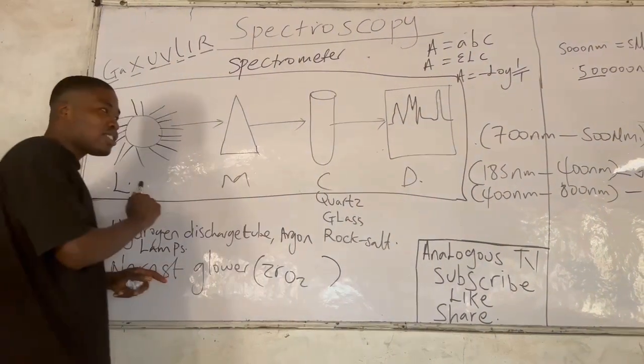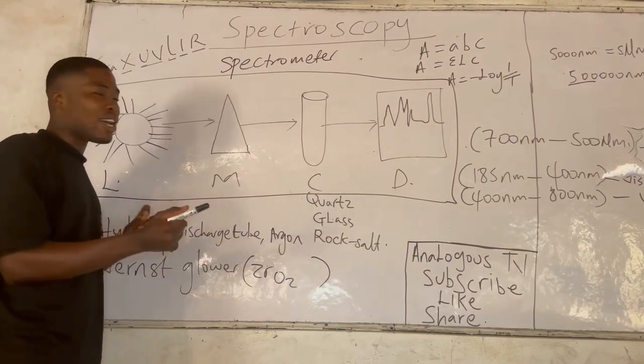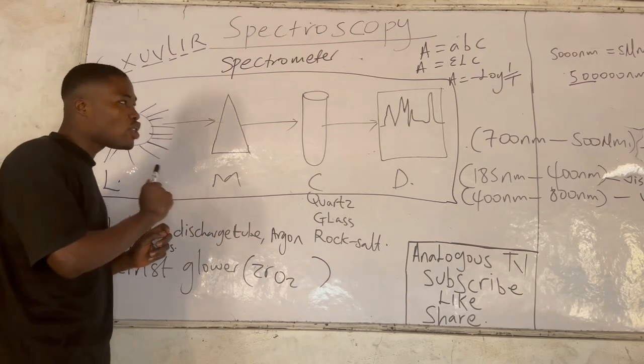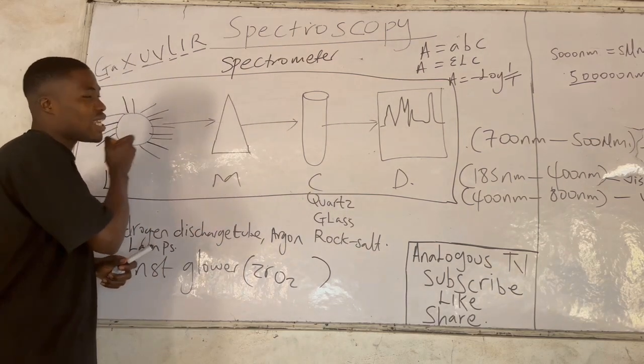These are the basic components. Various spectrometers have their various components. Some add a prism and scope, so they can have some other things, but these are the basic components of every spectrometer. Remember, the goal is to determine the structure, composition, or form of the organic compound with light.